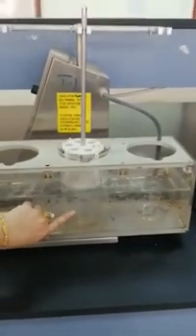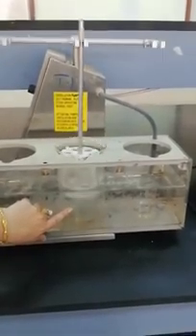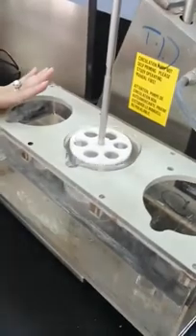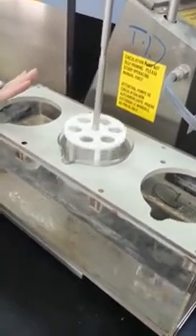We want to really watch the tablet because this is Rivaline paracetamol. Once put in distilled water, it is easily disintegrated because it's a fast acting drug. We have to monitor the time required for each tablet to get down from the sieve in the water. It's not required to dissolve all the tablets, just to fragment the tablet.